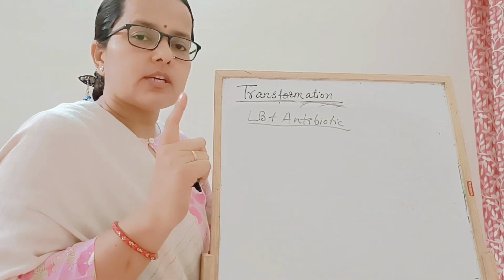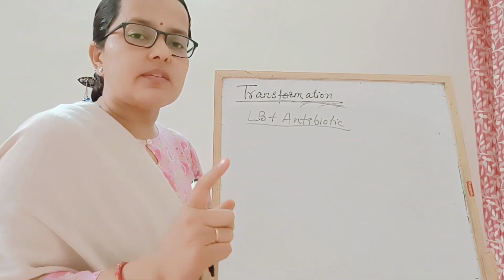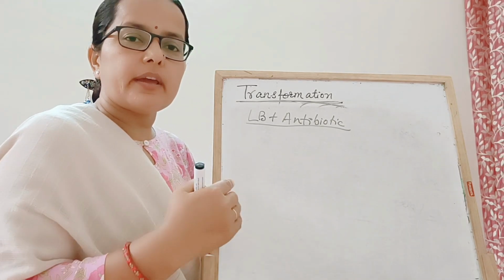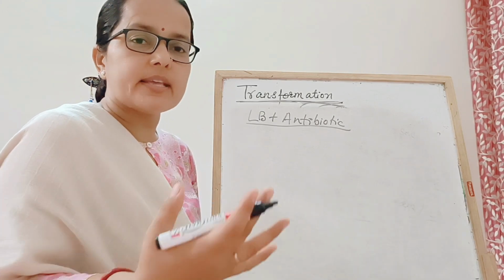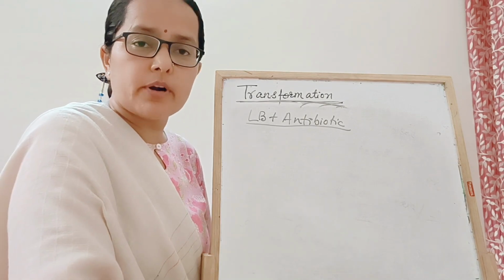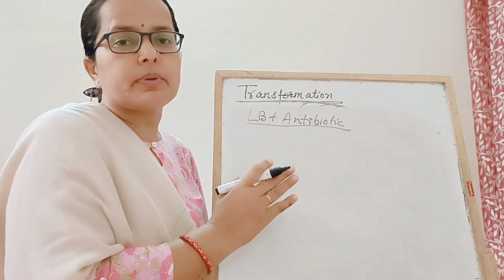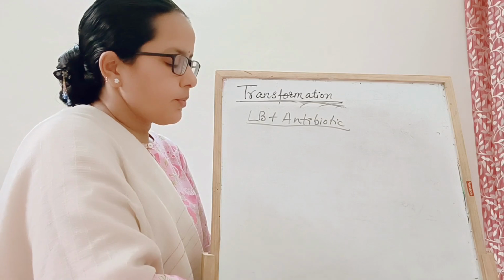Remember one thing, the concentration of antibiotic should be appropriate. Otherwise, you will get contaminating bacterial colonies, और air में जो आपके aerobic bacteria हैं, hands में जो आपके bacteria हैं, they will grow. And one more very important thing, you have to work in biosafety cabinet 2. Whenever you are plating your plates, you should be in biosafety cabinet 2. So you have to plate out.